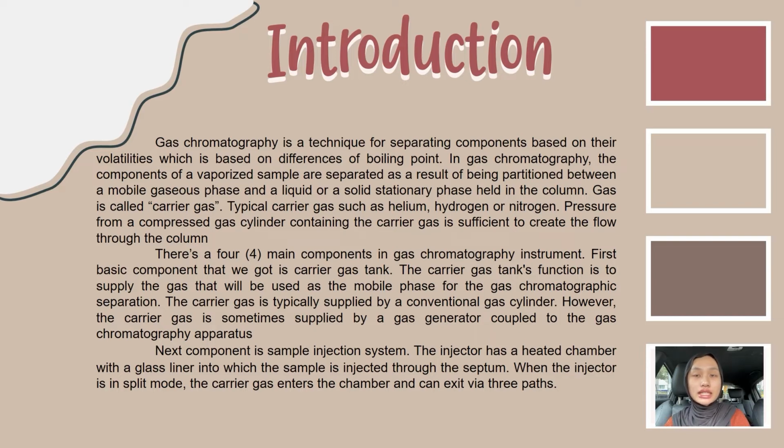Next component is sample injection system. The injector has a heated chamber with a glass liner into which the sample is injected through the septum. When the injector is in split mode, the carrier gas enters the chamber and can exit via three paths.